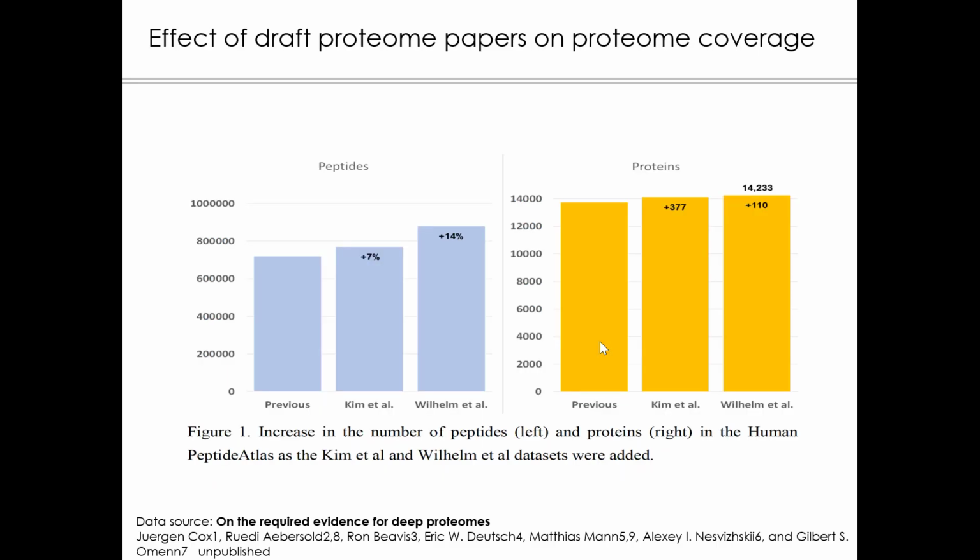And then a lot of effort was spent to reanalyze all this data together, because it is an important question whether we can say we basically know how a proteome looks to a mass spectrometer, or whether there is roughly a quarter of the proteome yet to be discovered. It has technical implications, but also biological implications, of course: whether we know how to measure all proteins or whether we are not able to.